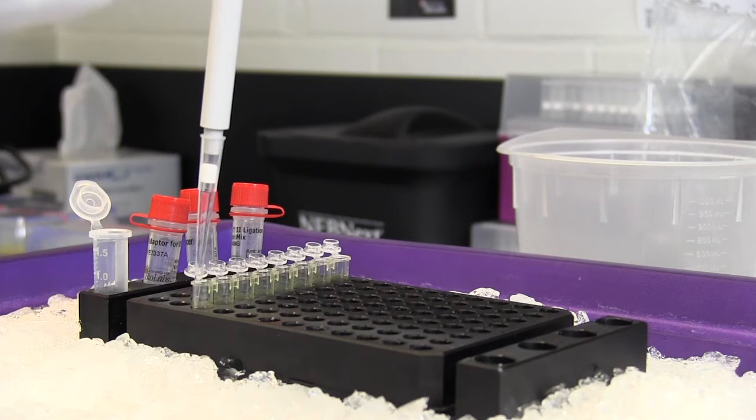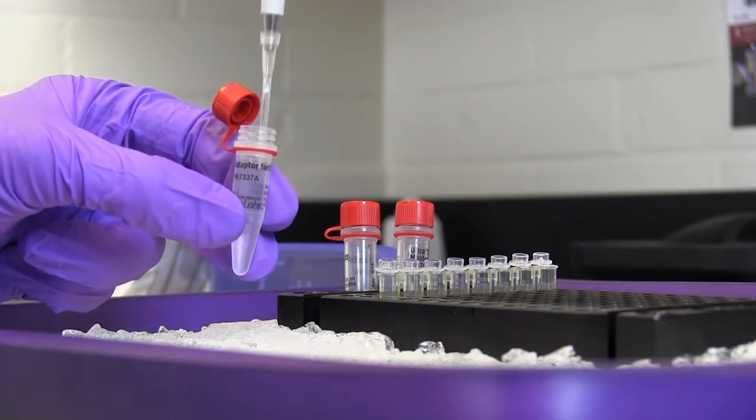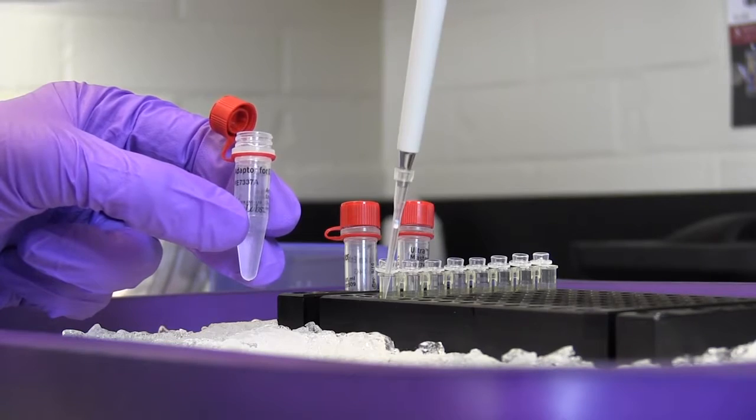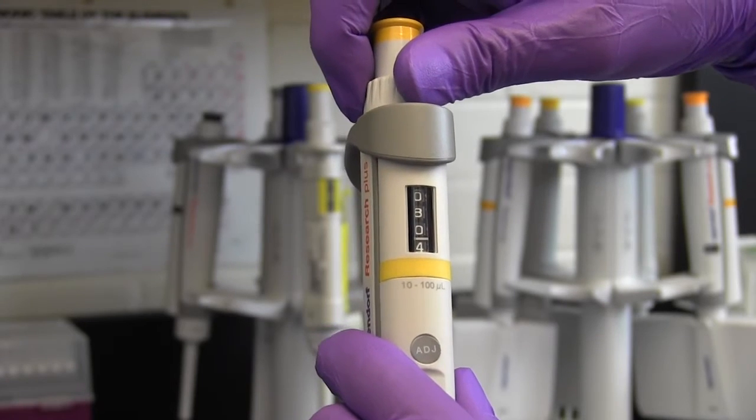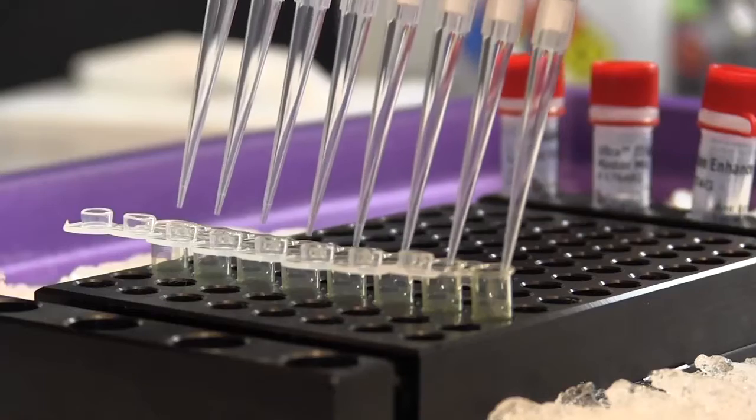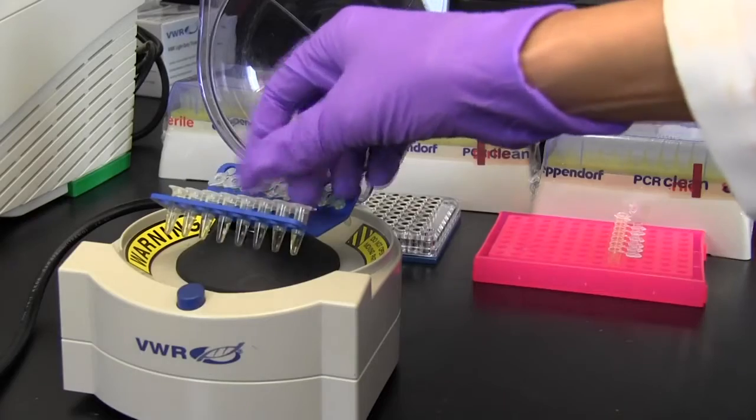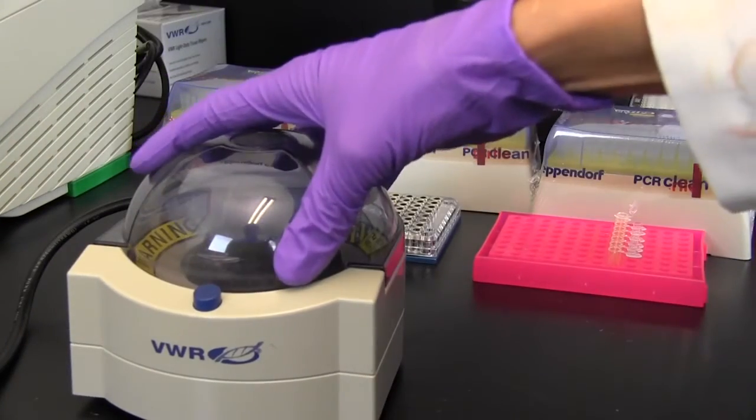Add the Ultra 2 ligation master mix, ligation enhancer, and adapter to the N-Prep reaction and mix well. We recommend setting a 100 or 200 microliter pipette to 80 microliters and then pipetting up and down at least 10 times. A quick spin will collect all liquid from the sides of the tube.